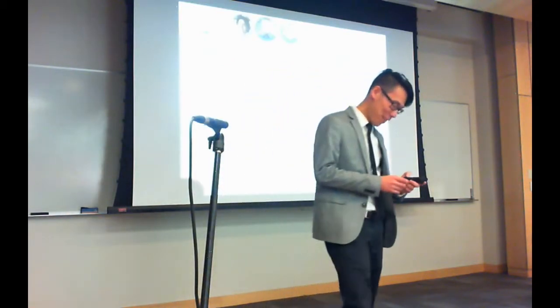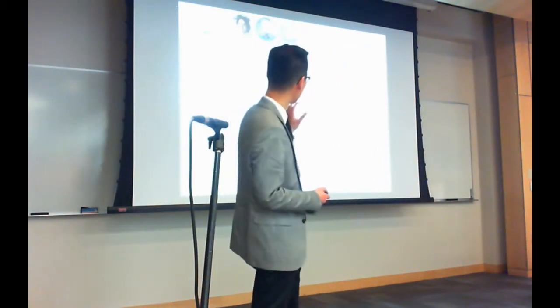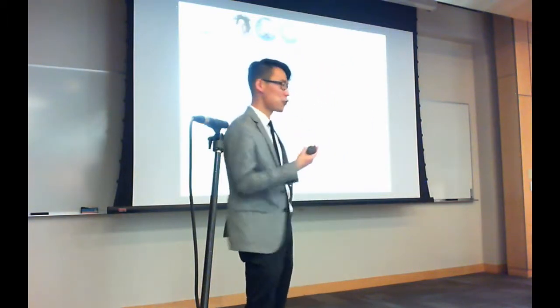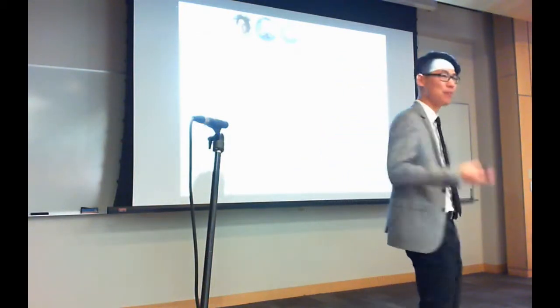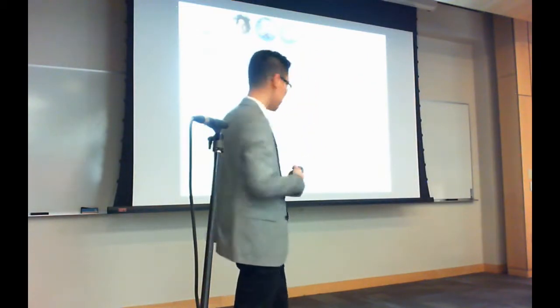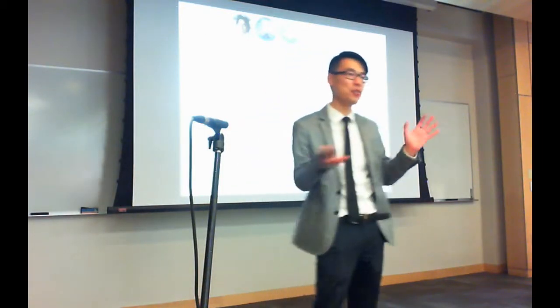Okay, so we need to control error in these libraries, and there are several ways to start attacking the error. One of the ways is we want to make sure that higher scoring spectra, or better quality, more reliable spectra, have better scores. That's actually handled by MS-GF+ and the spectral probabilities. If there is a better spectrum for a given peptide, that'll lead to a better score. If there's a better peptide, a better explanation for the fragmentation we're observing in a particular spectrum, you'll have a better score.